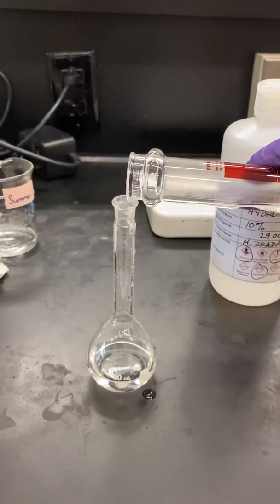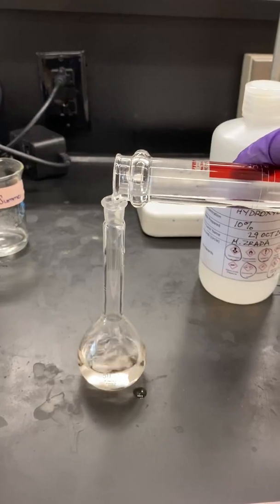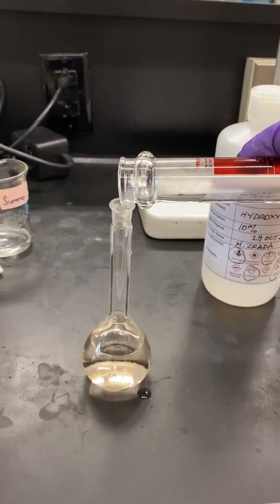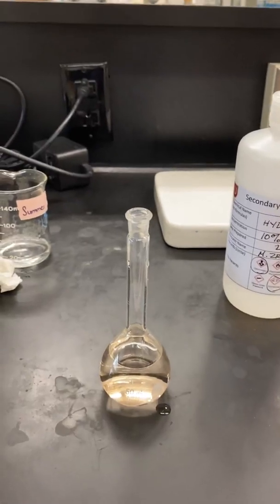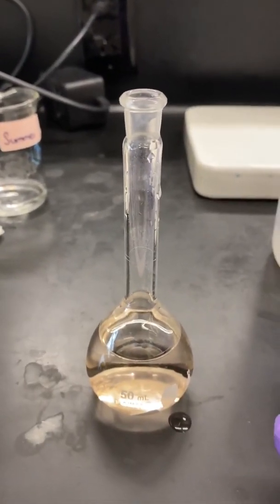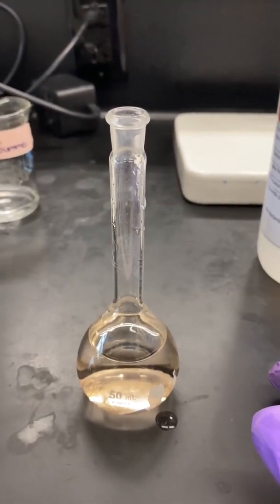If you've done this correctly, the solution should not change color until you add the phenanthroline. Upon adding the phenanthroline, the solution is going to start to turn a little orange color. The next step: fill the volumetric flask to the mark with distilled water.